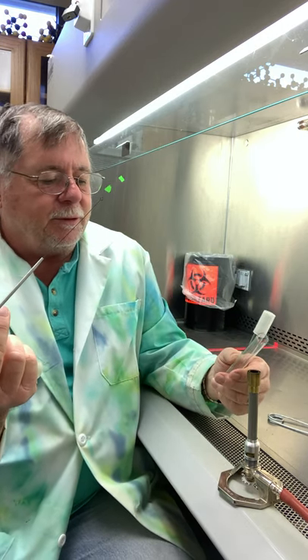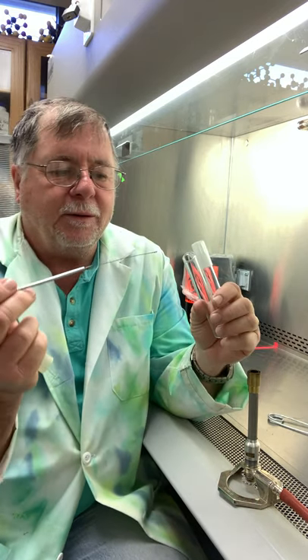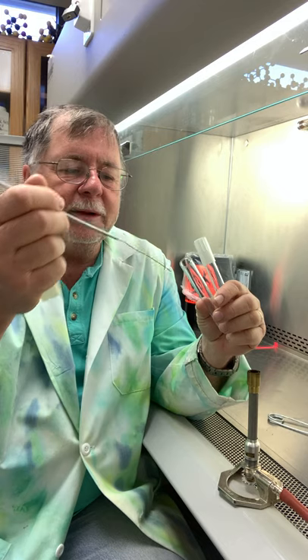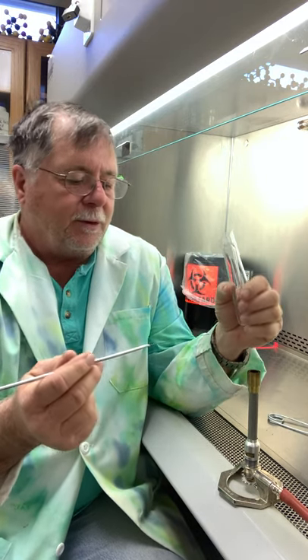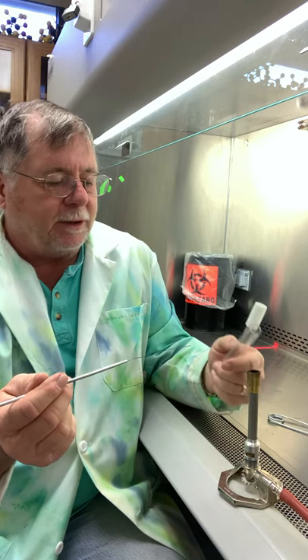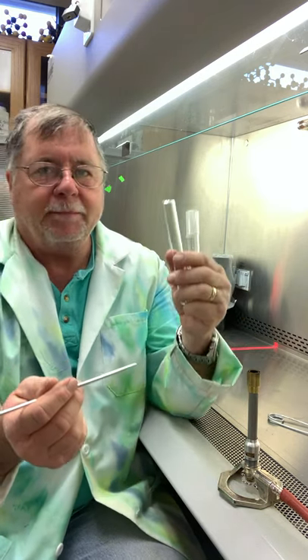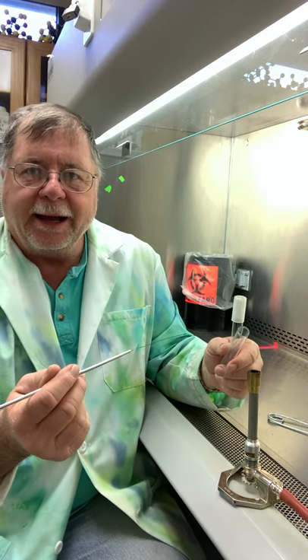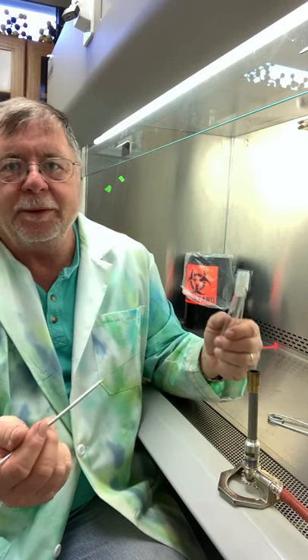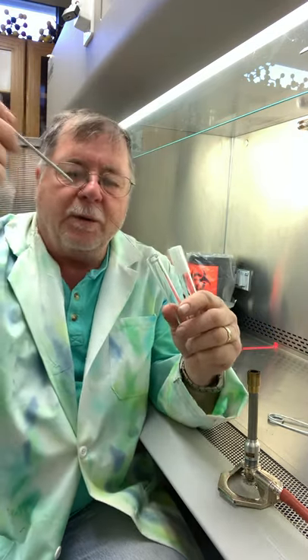And so all we do is rotate it through until we've heated the whole inside and outside of the tube tip. You don't want to hold it in there very long, so just roll the tube as you do this and then pull it out. If you hold it too long in the heat, it will crack the glass and then you've just lost your experiment. So we're going to put it in there, roll it, and then we can go in.